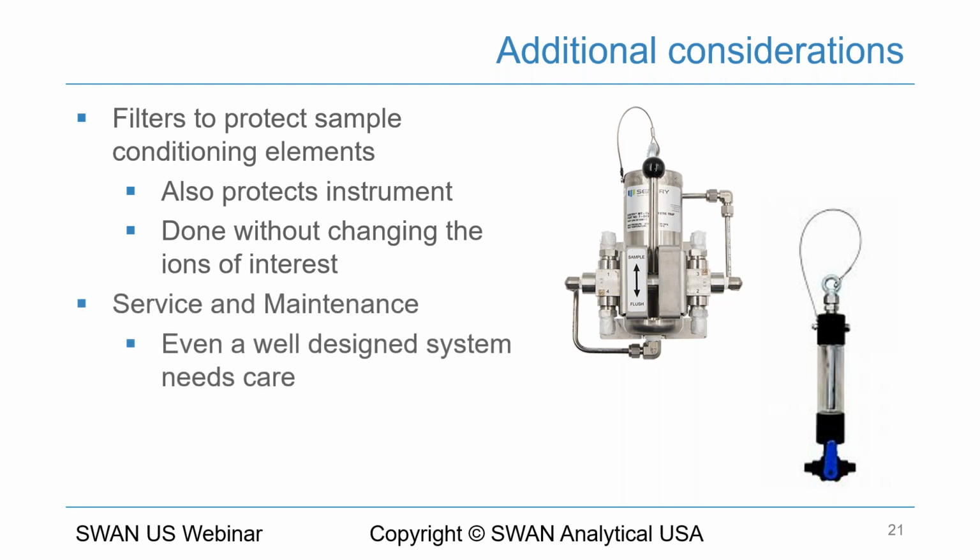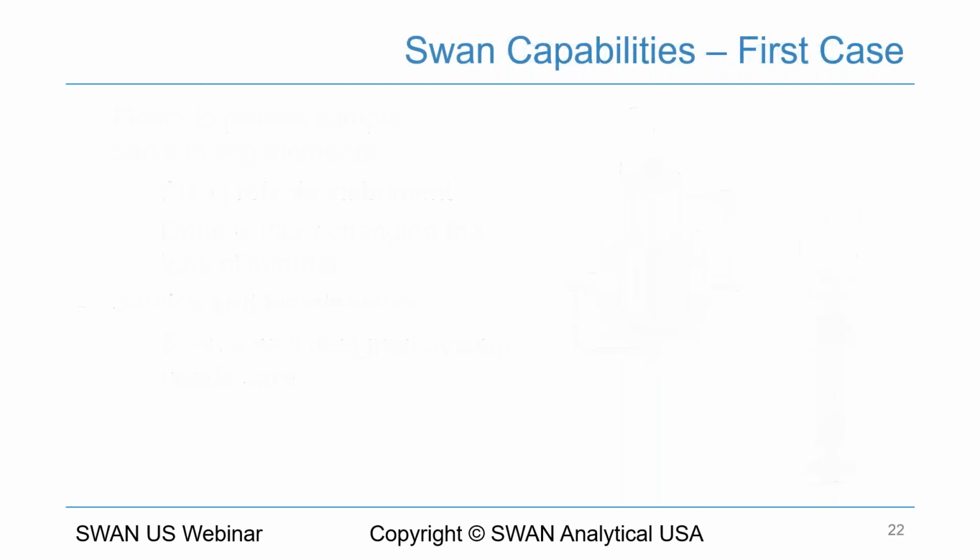The other thing we look at is service and maintenance, because even a well-designed system is going to need maintenance and care. Calibrations need to be done, the analyzers need to be cared for, and those are part of the design considerations.